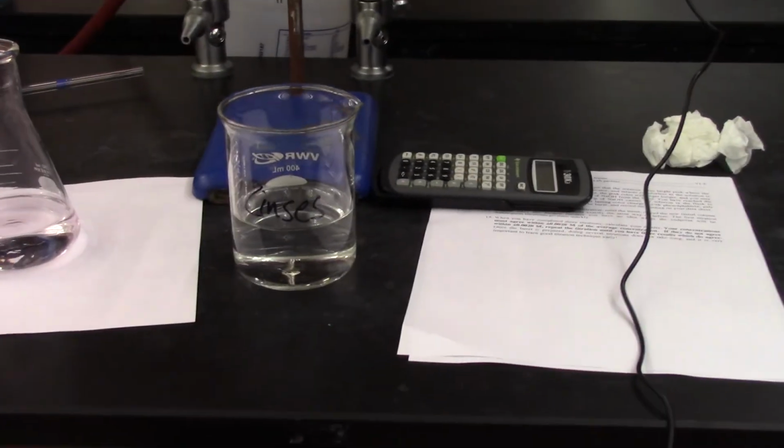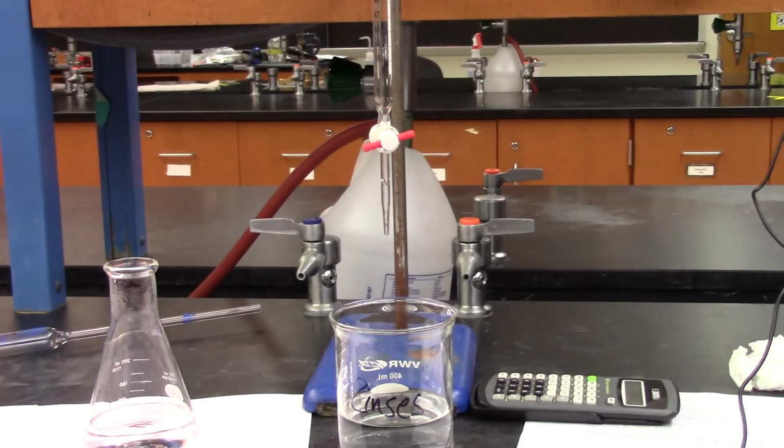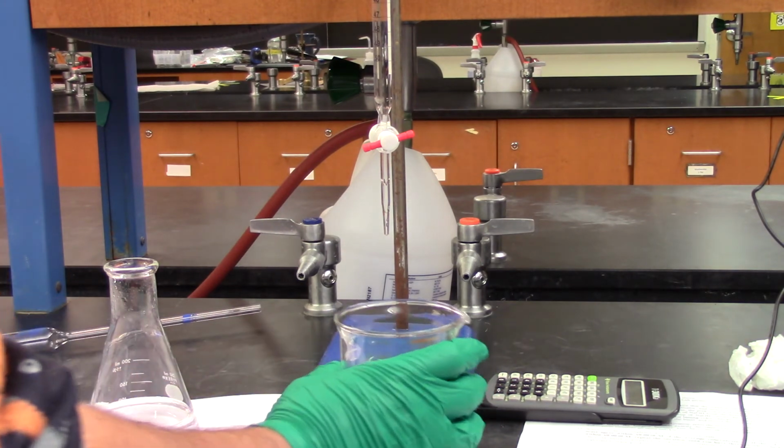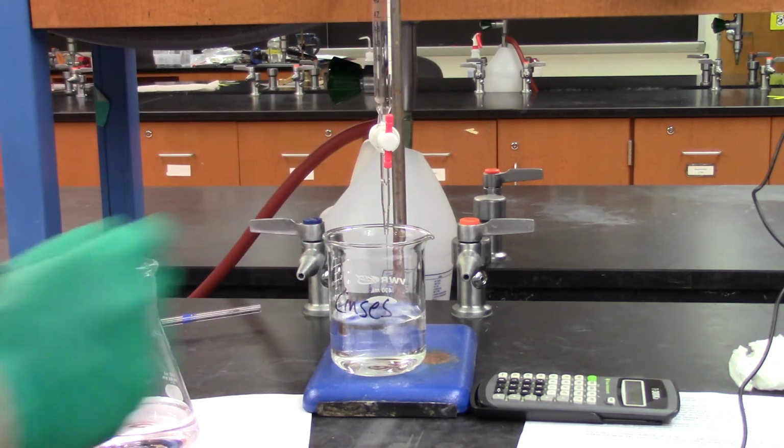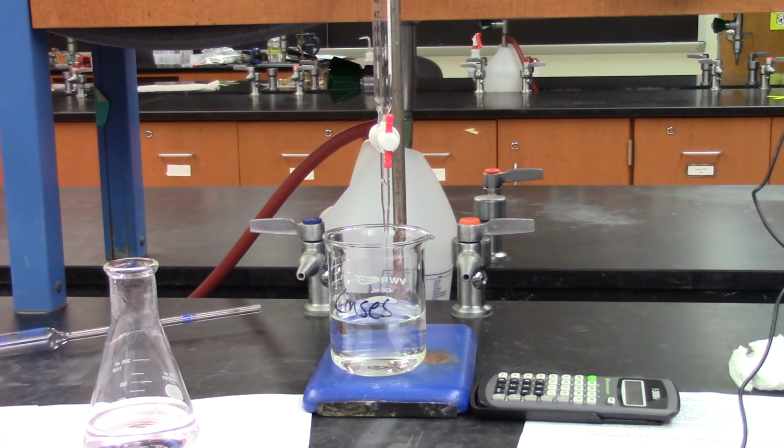So once you're done with that, go back to the burette real quick. My rinses, I'm going to rinse through my burette and allow my solution to go through, because now I suspect that I'll have good titrations. It's all worked out with the math, looking at how much of my KHP I've used, so that's very good and affirming to me. I'll rinse this through here with some water twice. This is just my base leaving, but I'll rinse through.